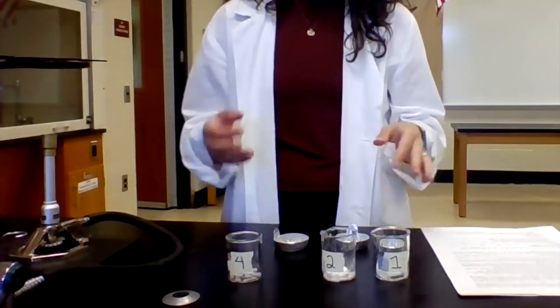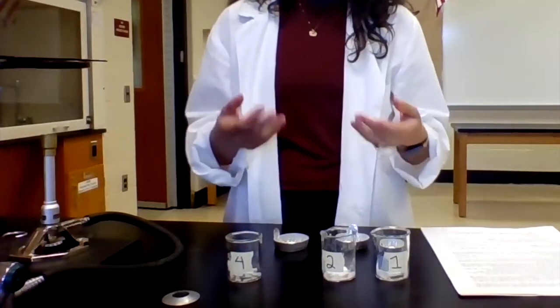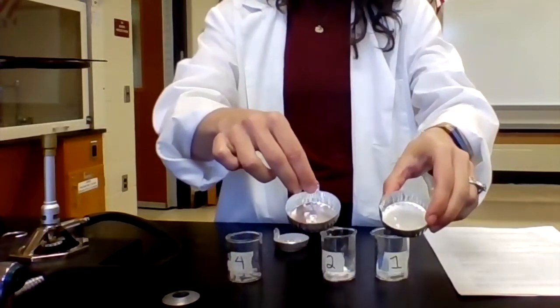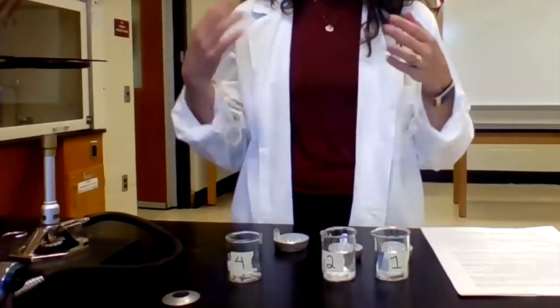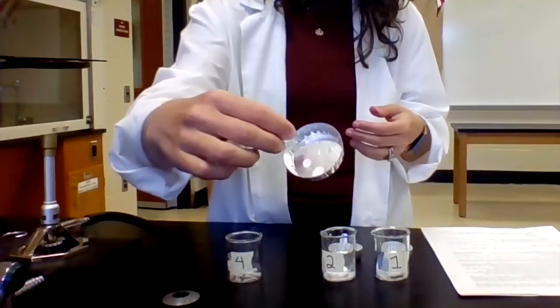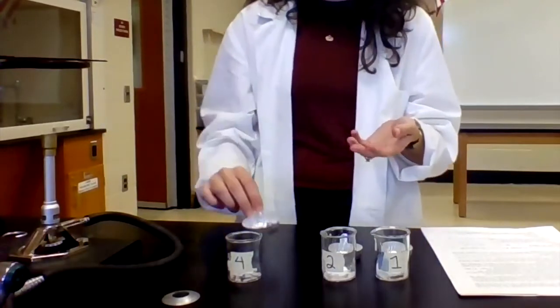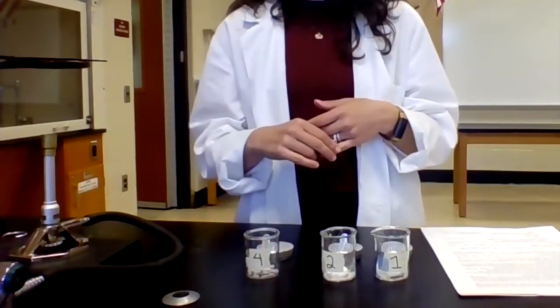All right, so at this point, I've tested these 3 solids, holding them over the hot water bath to see if they have a low melting point. What I can see here from 1 and 2 is that they did not melt. So that tells me that solid 1 and solid 2 do have at least moderate, if not high, melting points. But solid 4, we can see these little puddles where those pellets have melted. So solid 4 did melt, so it has a low melting point. That tells me that it is most likely non-polar covalent.